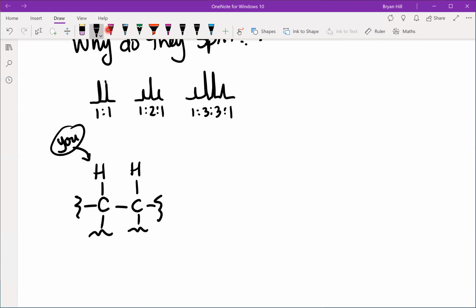If we think back to the way that the whole NMR process works, you're a proton, you've got a nuclear spin quantum number of I equals 1/2. So when you're not in a magnetic field, you're basically randomly pointing in any direction you want to be. But then you're put in a magnetic field. What happens when you are placed in that magnetic field, B0?